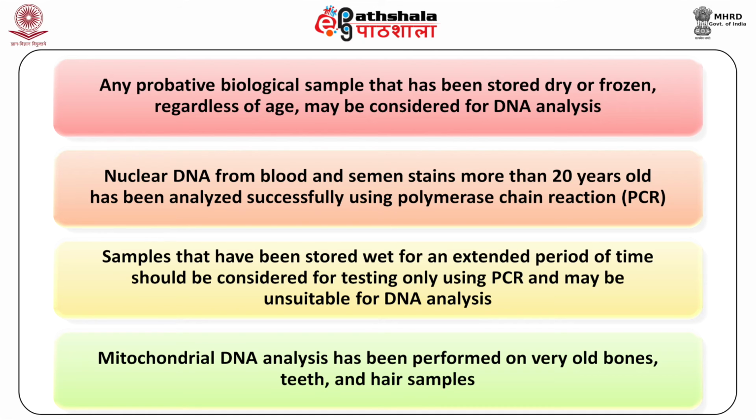Samples that have been stored wet for an extended period of time should be considered for testing only using PCR and may be unsuitable for DNA analysis. Mitochondrial DNA analysis has been performed on very old bones, teeth and hair samples.